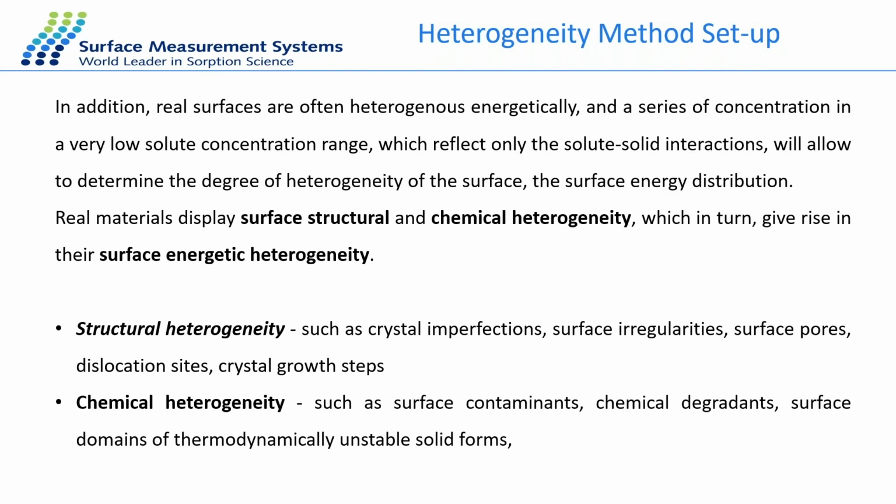Also, real surfaces are often energetically heterogeneous, and the series of concentrations in the very low solute concentration range, which reflect only the solute-solid interaction, will allow us to determine the degree of heterogeneity of the surface energy distribution. Because real materials display surface structural and chemical heterogeneity, which in turn gives rise to their surface energetic heterogeneity.